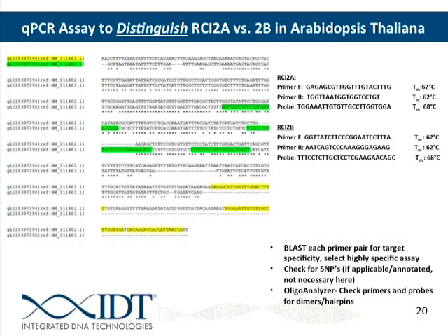And so for here, we see there are some mismatches between the sequences, especially in this area. And then we get to here where there's a whole region that's present in 2B that's absent in 2A. So it would be nice if we could target our probe to this area right here that's not present. That way, even if we do get some amplification, the probe's not going to be able to lay down over that region that's absent, so we shouldn't get any signal. So that's what I'm going to try first. You can also try laying down one of your primers in that area as well and avoid amplification altogether.